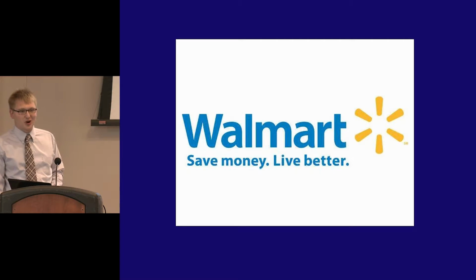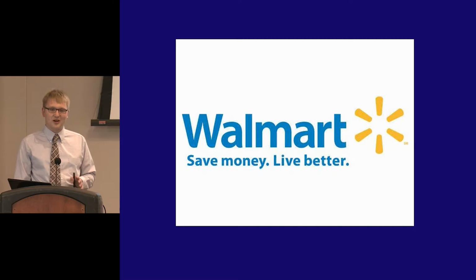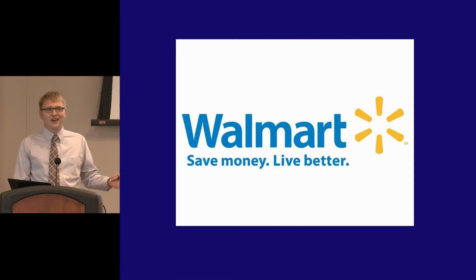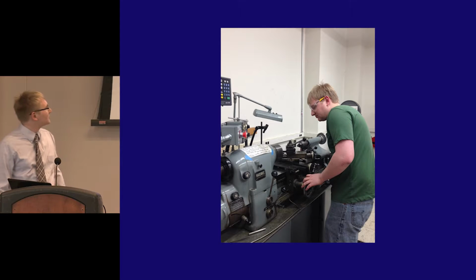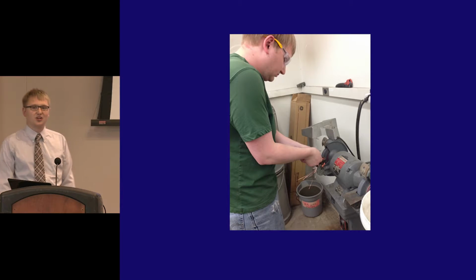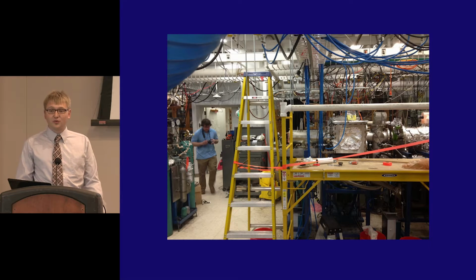So here's the real problem. If you want your very own magnetic bottle photoelectron spectrometer with electrospray ionization, you can't just go out and buy it at Walmart or order it on Amazon Prime. You have to build it. So here I am, hard at work, constructing a focusing lens on our chemistry department lathe. Here I am grinding a tool to cut the O-ring groove that we're going to use later. And here's a before picture.